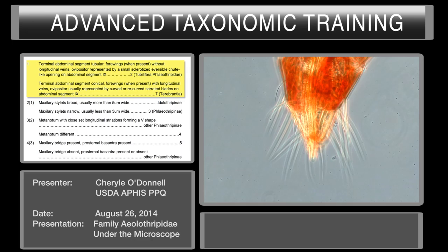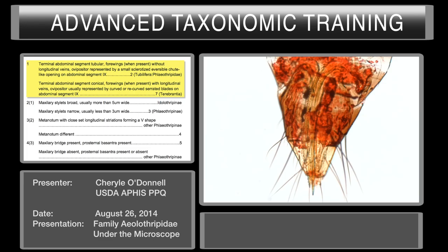We're going to use the key for this training session: the NPDN training video Thysanoptera key. We're going to start out with couplet number one. This couplet will ask about abdominal segment number ten. Please put the specimens I have provided into the microscope and we'll take a look at abdominal segment number ten.